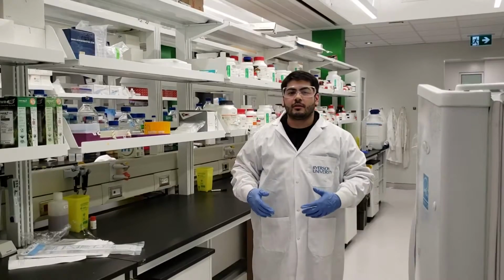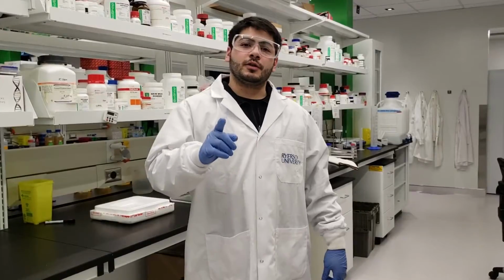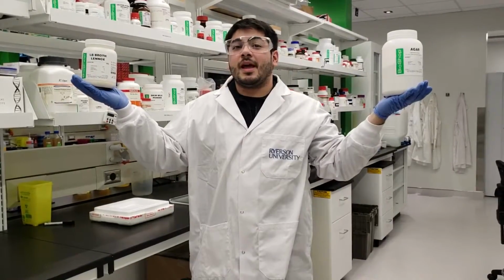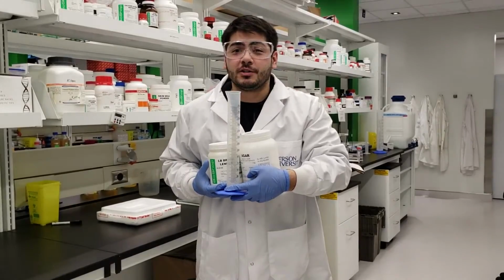Okay, looks like we've got everything, so now let's get our reagents. First thing we need is LB powder. The second reagent we need is agar. And lastly, we're going to need some distilled water. Now that we have all of our reagents, let's head over to the weigh station.